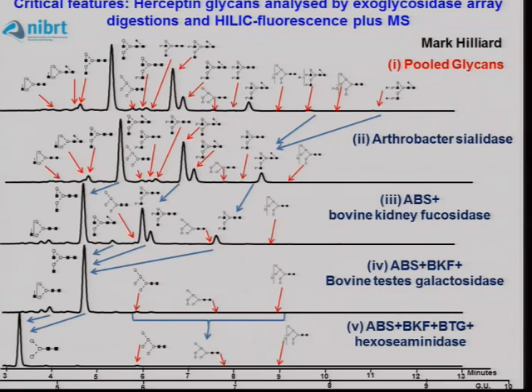Use a mannosidase on this, or you take this pool from here and you add a mannosidase into it. But you have to look at these. It tells you that you've got other structures there you should be looking at. So if you like doing puzzles, it's really quite satisfying to be able to do these kinds of things.